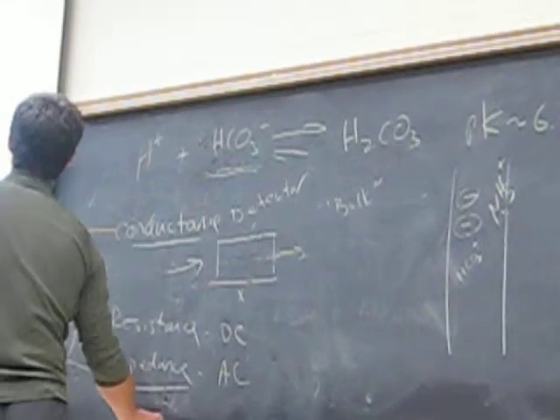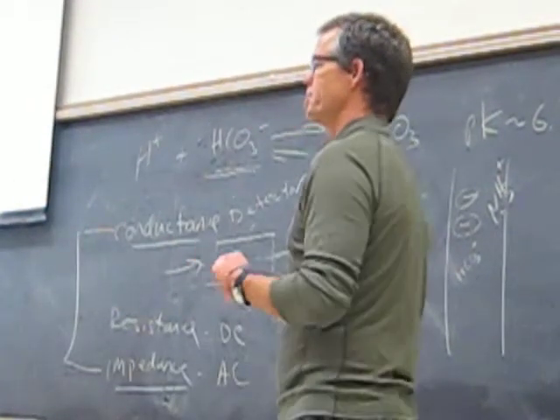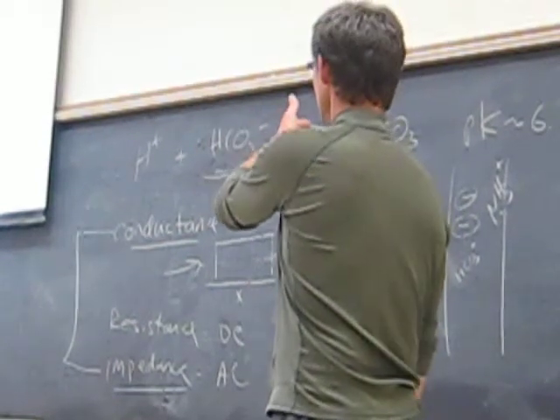Okay, so now let's back up a little bit. If we think of liquid chromatography, and the methods we were just looking at from Dionex, that's not, of course, just applying to ion chromatography.